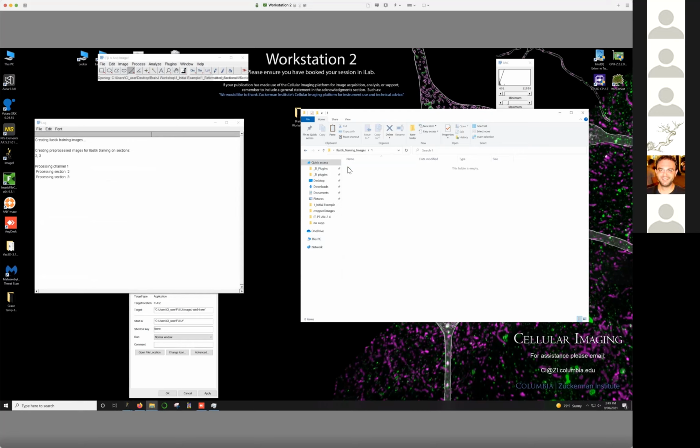There was some changes to it. Oh no, it's working. Yeah, if you do run into any problems on the pipeline, don't hesitate to reach out. Every now and then, ImageJ is constantly updated, and there'll be an update that breaks part of the pipeline, and that's usually just a simple fix that I can take care of. So, if you do hit a wall using it, don't be afraid to send me an email, and usually it's a simple problem that we can fix.